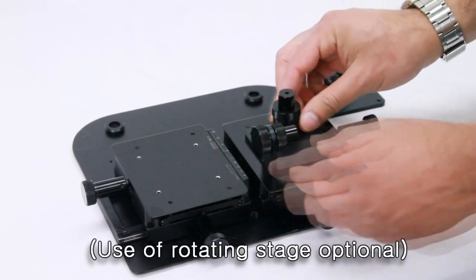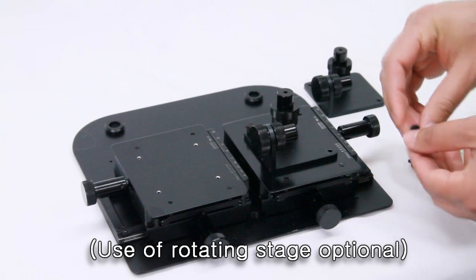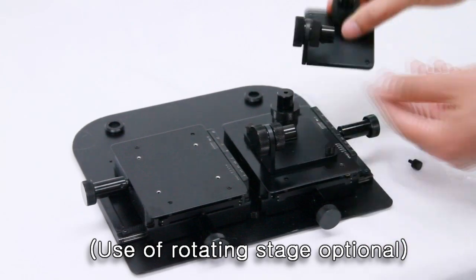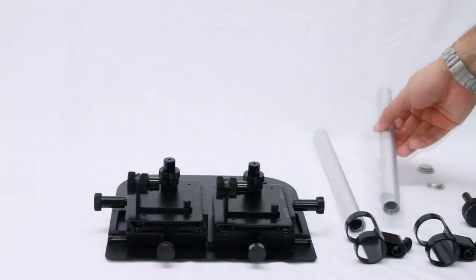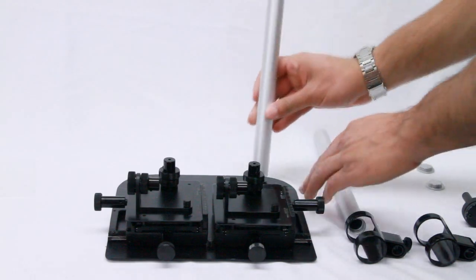Attach the subject rotation stage onto the XY base with the included bolt. Then connect each vertical pole to the visible threading on the base.